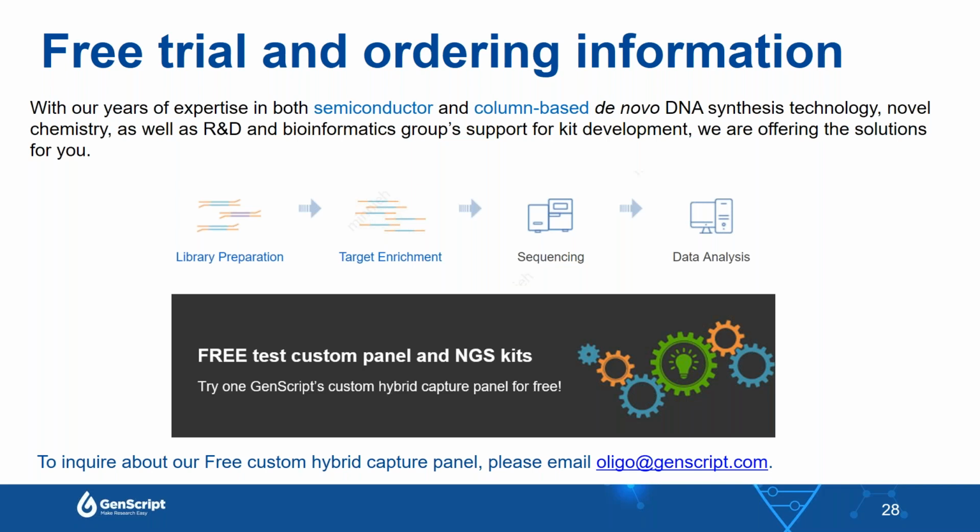Oh, sure. Sorry for the confusion. For the 0 BP flank, a base in the sequencing data is considered an on-target base only when it falls into the target region. As you can see, this is very strict. But for 150 BP flank, a base that is within the 150 BP upstream or downstream of the target region is also considered part of the target when calculating on target.